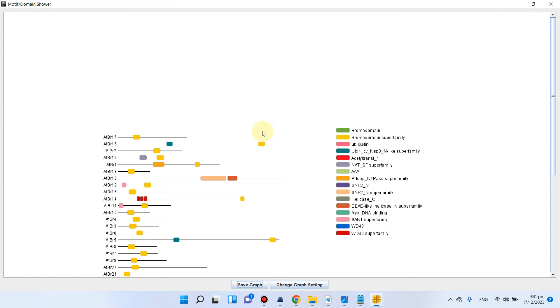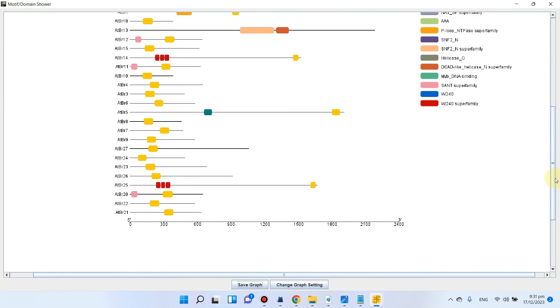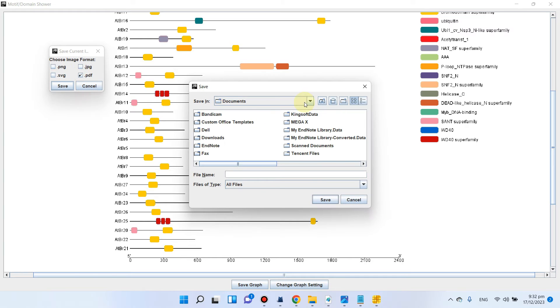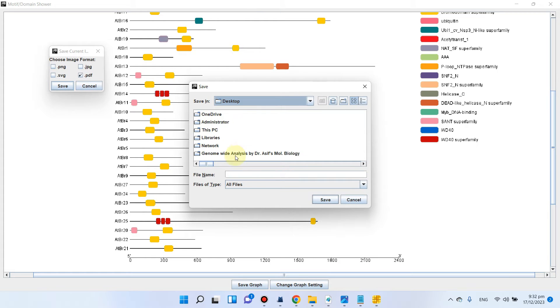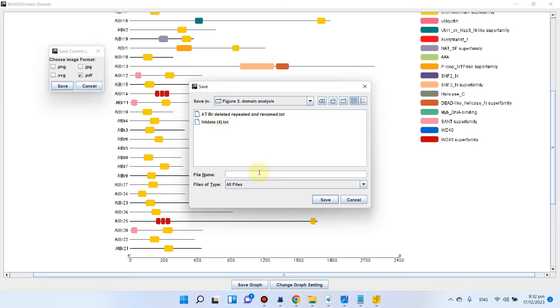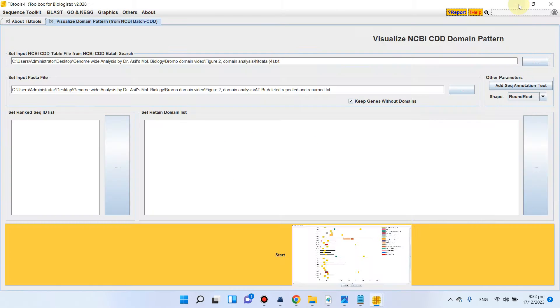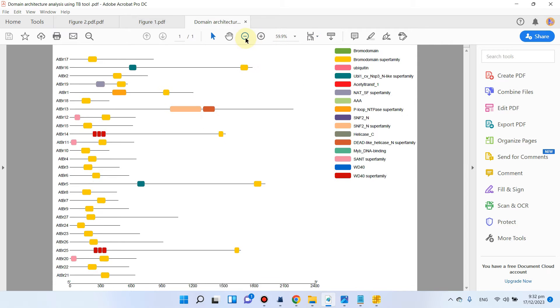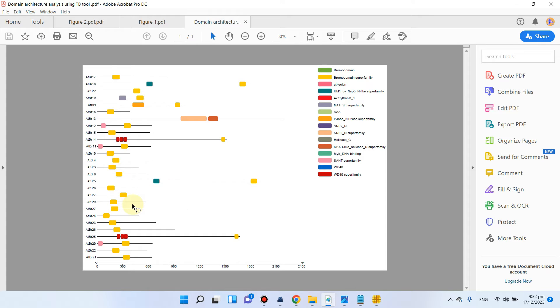Simply click the Start button. You can see it has generated our domain architecture analysis. We can save this graph as a PDF to our Figure 2 folder — going to Desktop, then the domain video folder, then Figure 2, and naming it 'domain architecture analysis using TB tool.' Our image is saved and the domain architecture analysis is ready.